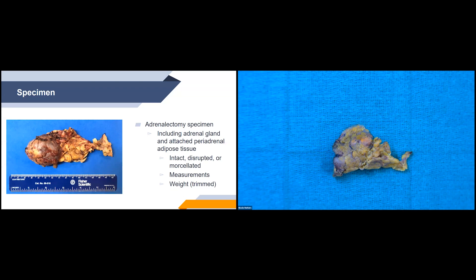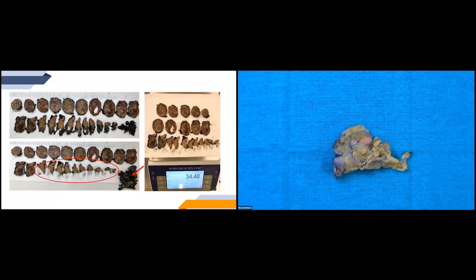There are a few ways to obtain the trimmed weight. Most importantly, we don't want to cut off the fat before sectioning through the specimen because we could potentially cut off an area of tumor extension into that soft tissue, which is important for staging. One method: ink the resection margin, serially section the entire specimen, then remove all the soft tissue and weigh just the adrenal gland and mass. Another way is to weigh the whole specimen first, trim the fat, weigh the fat, and subtract it from the overall weight.